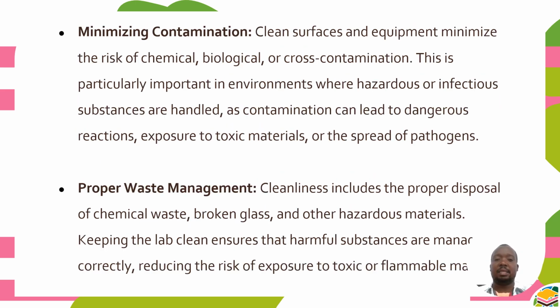Then minimizing contamination. Cleanliness is very, very important because it minimizes contamination, because we don't need to contaminate anything in the lab. Clean surfaces and equipment minimize the risk of chemical or biological contamination.